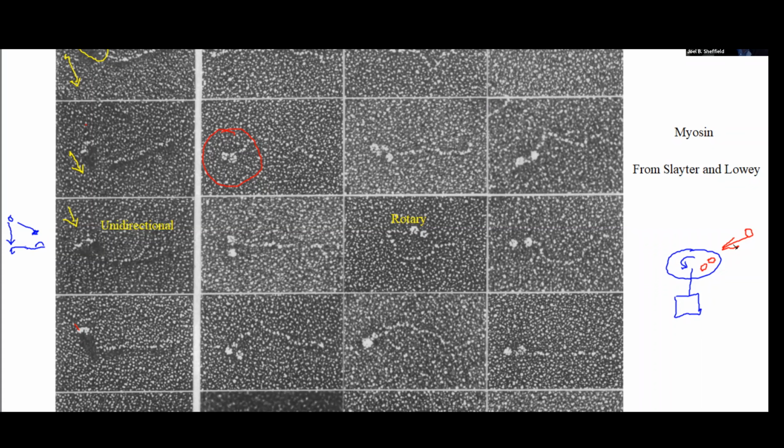And depending on how long it takes to evaporate the material and how quickly the motor turns and all the rest, I can get an image like this in which you actually don't make out much in the way of shadow. But what you do see is this area that's been enhanced by, in a sense, being shielded from the shadow as it goes by. So you might imagine what's going on here.